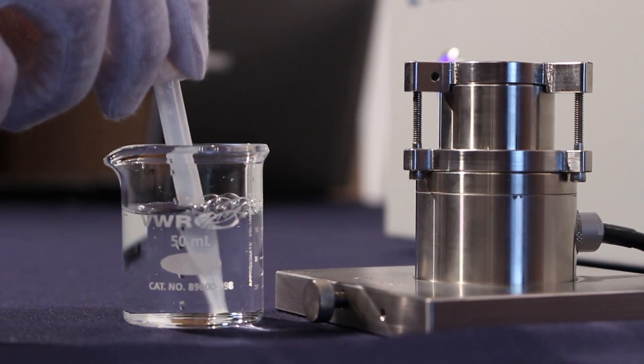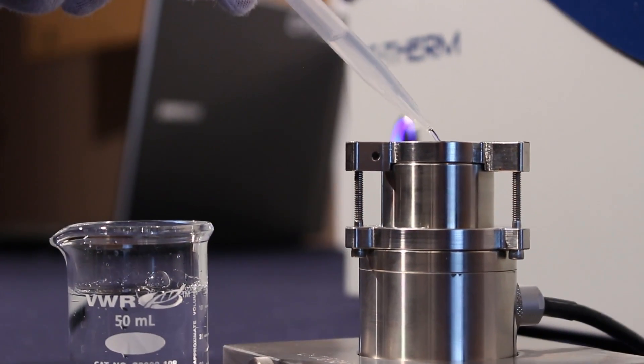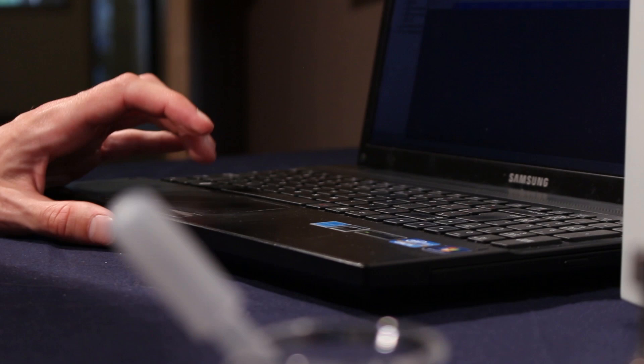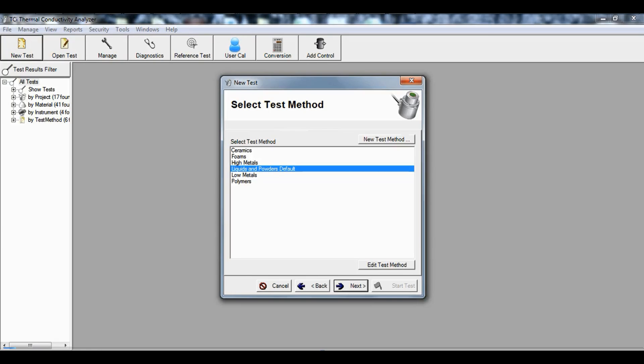In taking a measurement all we have to do is fill this small volume test kit with an effective amount of material and choose the liquids calibration from the software.